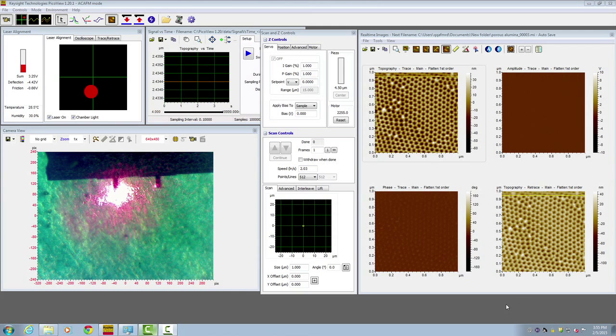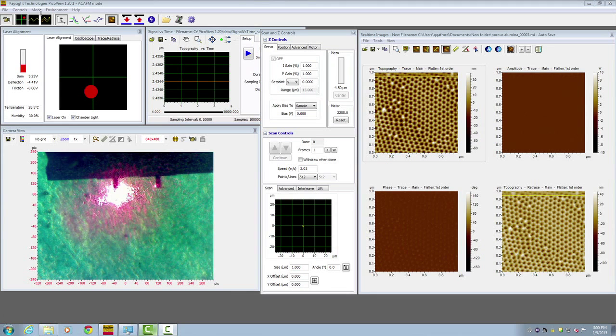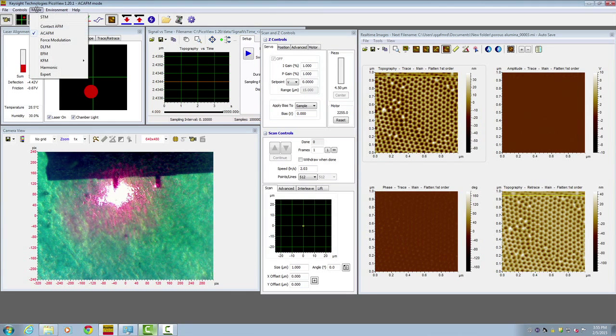Now let's do contact mode imaging. First, go to the imaging mode in the software and choose contact AFM.